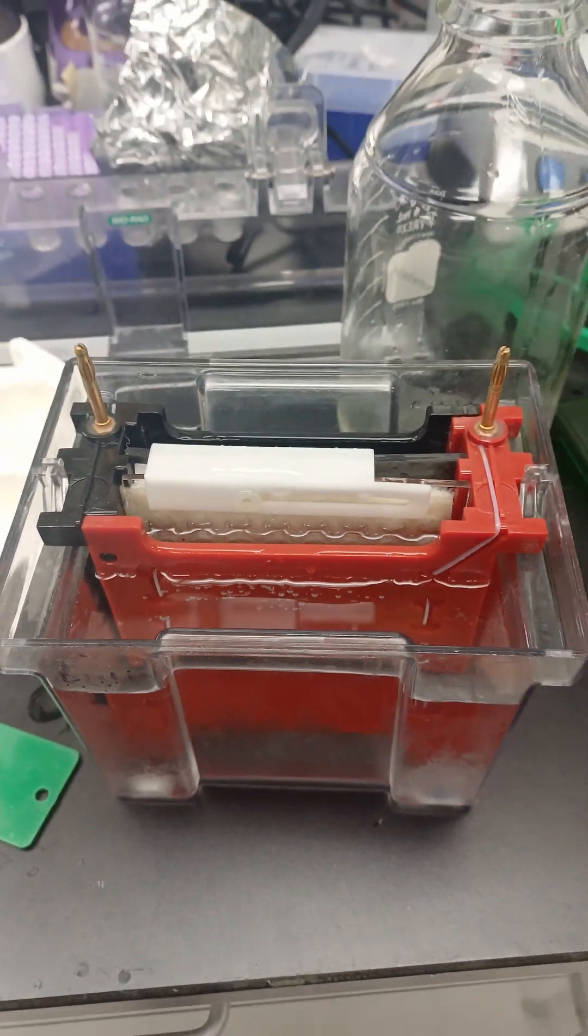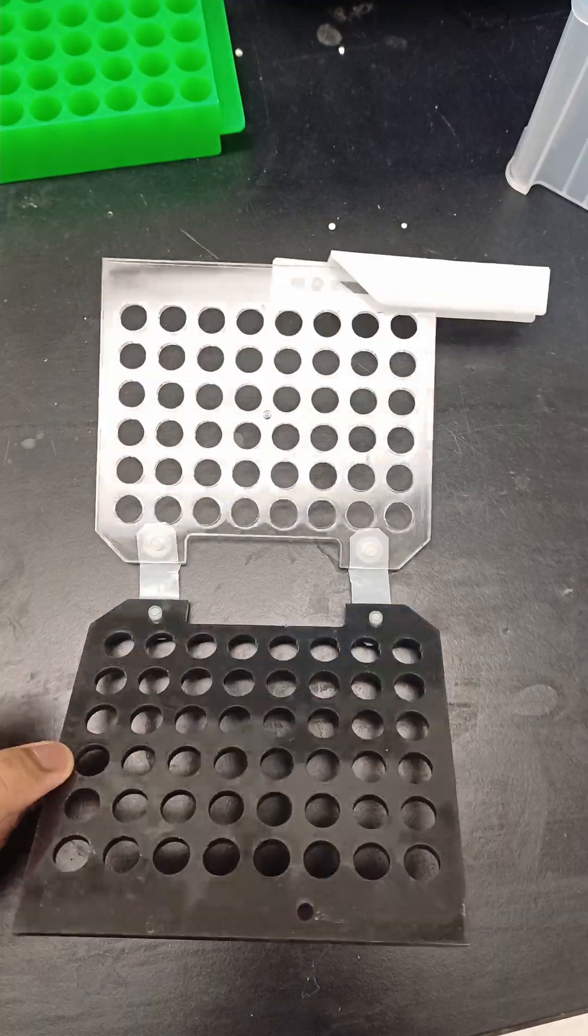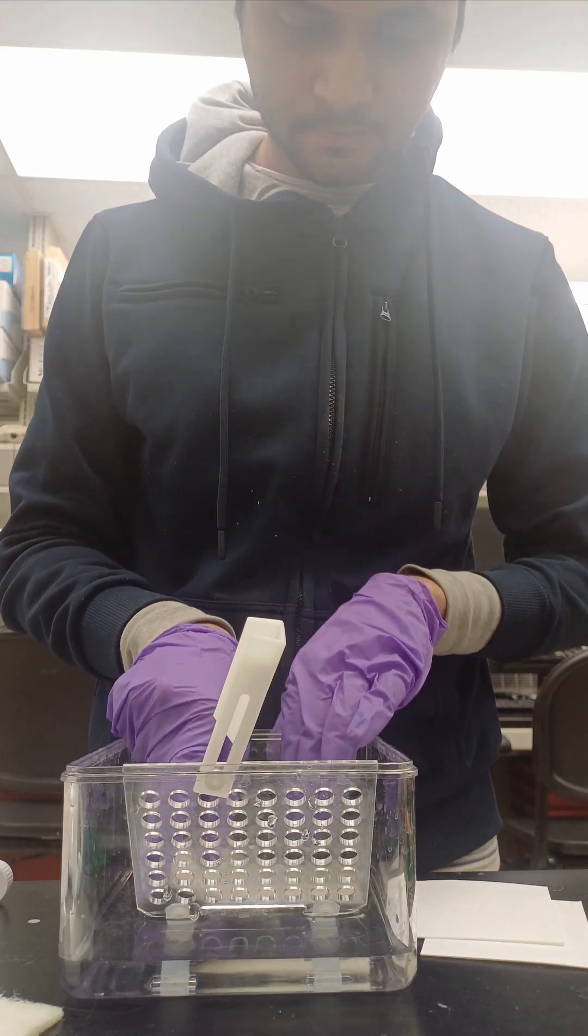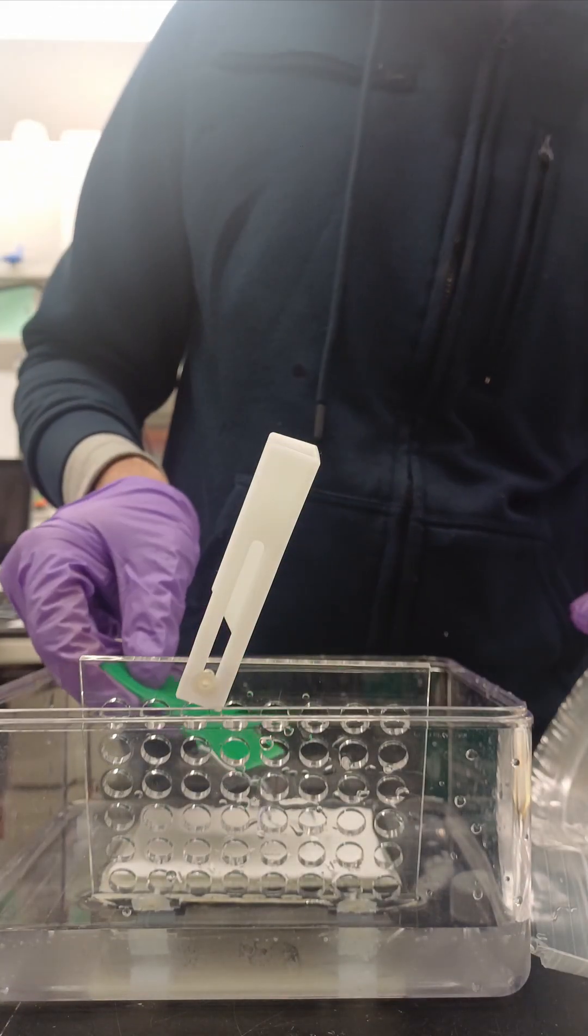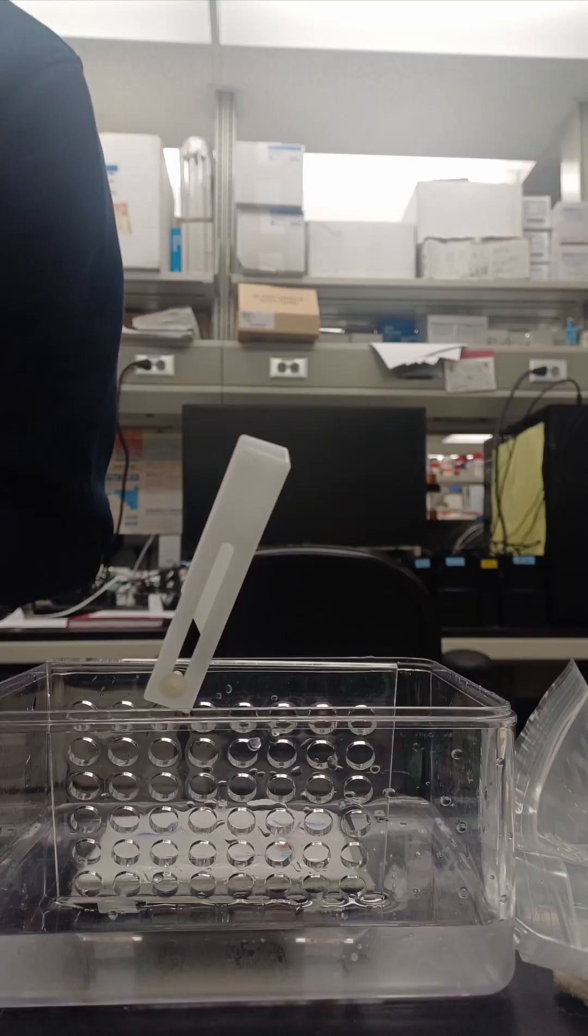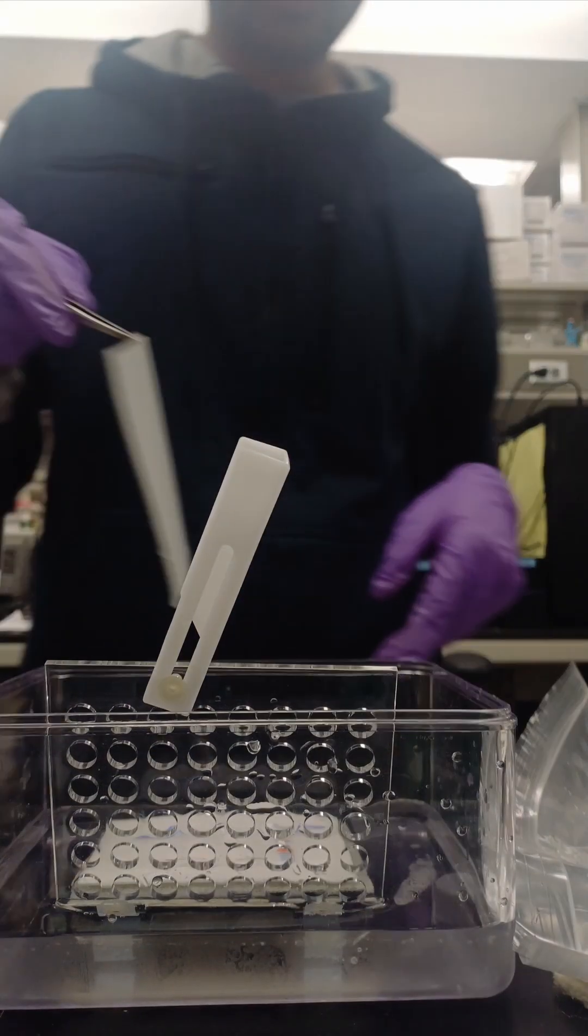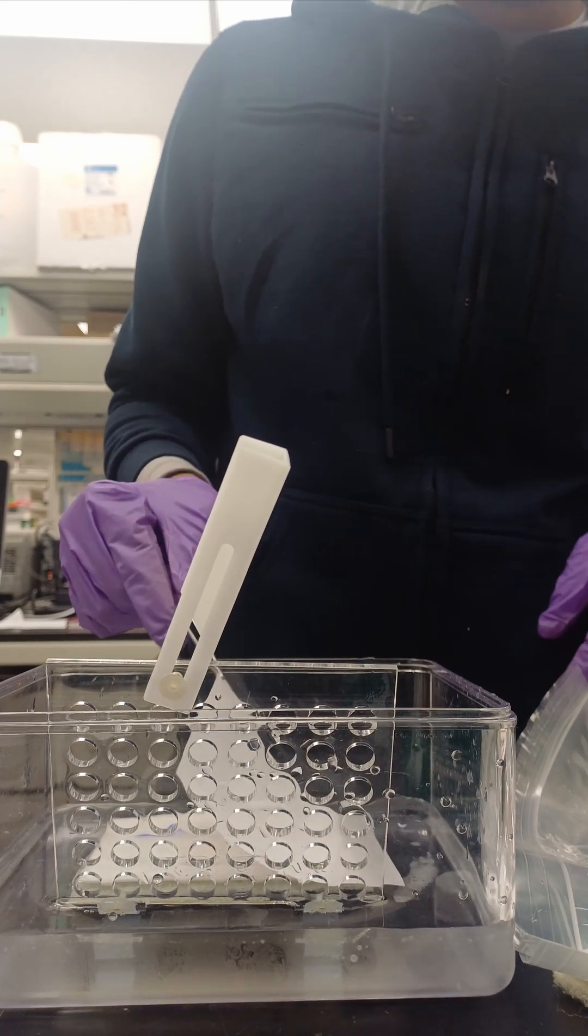I am doing a wet transfer so I start by layering the cassette from the black side with foam and then the filter paper. Now be very gentle by placing the gel because it's fragile and can tear easily. Then place either the nitrocellulose or PVDF membrane covering the gel completely.